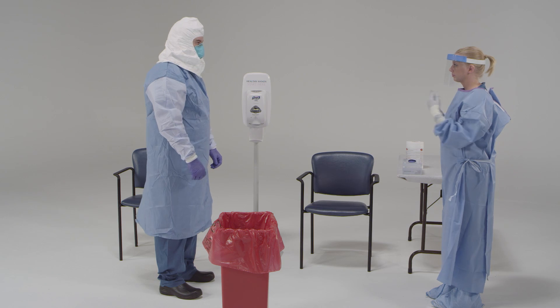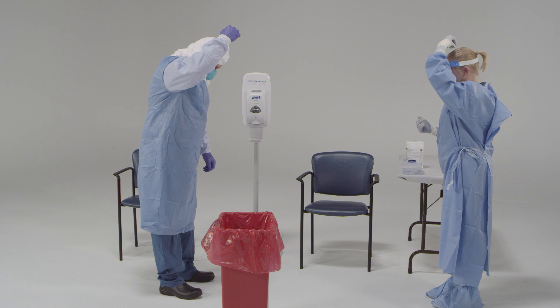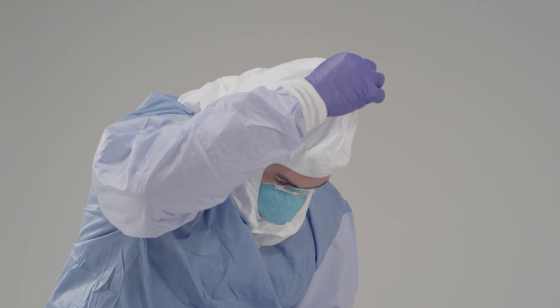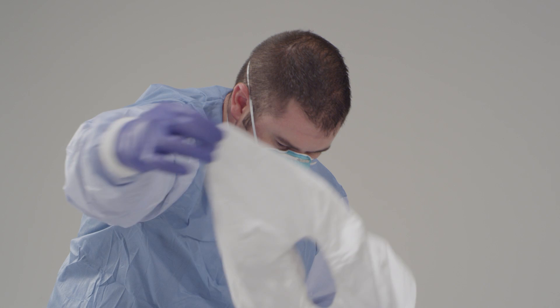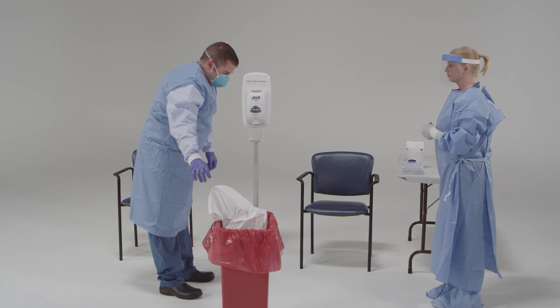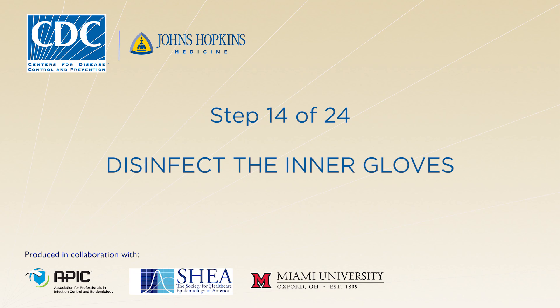Next, slowly remove the hood. To do this, tilt your head slightly, grasp at the crown of the head, and use one hand to pull the hood forward, away from the body, and off the head. Dispose of it. Now disinfect your gloves.